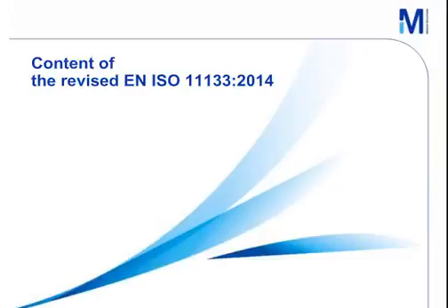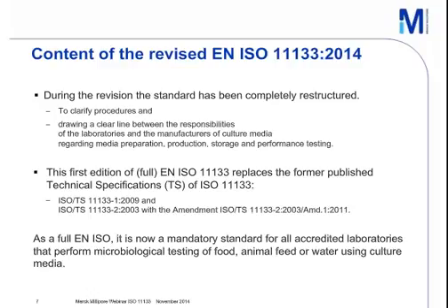Now I would like to give you content of the revised EN ISO 11133 from this year. It is a very heavy standard and we can give only some topics in the short time. It has more than 106 pages.